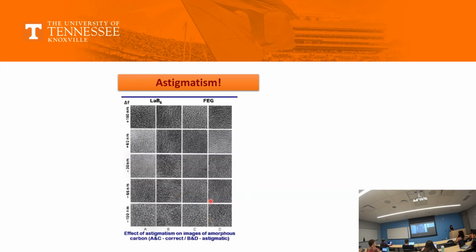And here, what you see on the screen is astigmatism. This is the number 1 step that you will learn at the end of your alignment. When you have aligned your condenser, your objective, your camera, you know the exposures, you know everything is working fine, then your instructor will take you to an amorphous zone.